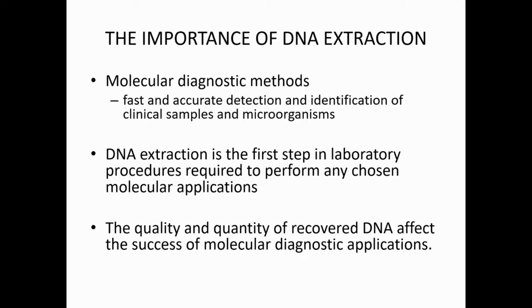The extraction of DNA is so important because in recent years, the advance in molecular diagnostic methods provide fast and accurate detection and identification of clinical samples and microorganisms. And these techniques have been developed particularly to use the DNA or RNA, and try to analyze the DNA and RNA to get the information. So that is the reason why the DNA extraction is so important, okay, and in recent years, especially the last 10 years, it has become extremely important.